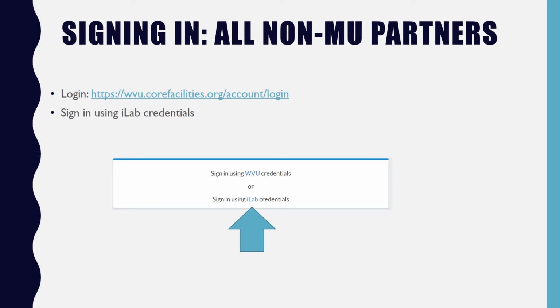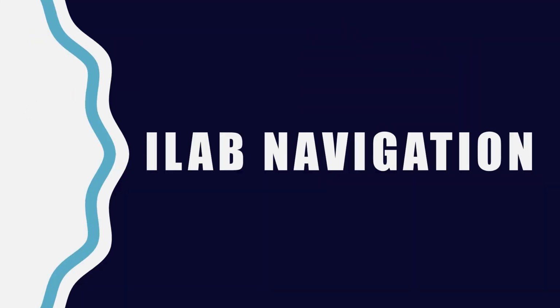Once you have your account created and verified, you'll sign in. All non-Marshall University partners will use the iLab credentials link. Next, I'll go over how to navigate through iLab. Start with the homepage.